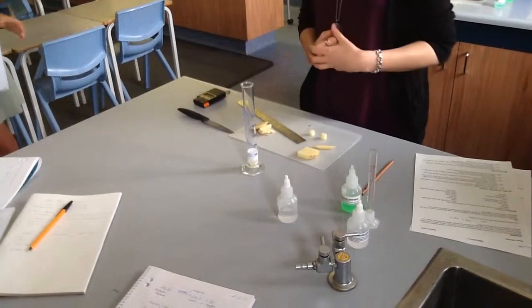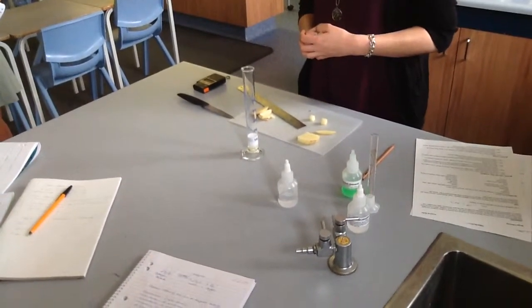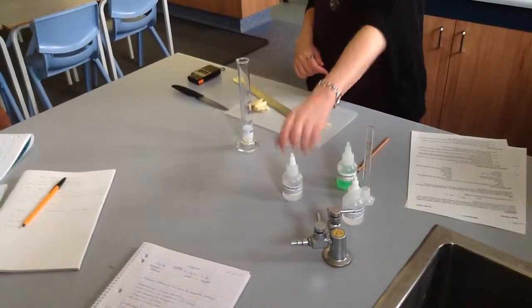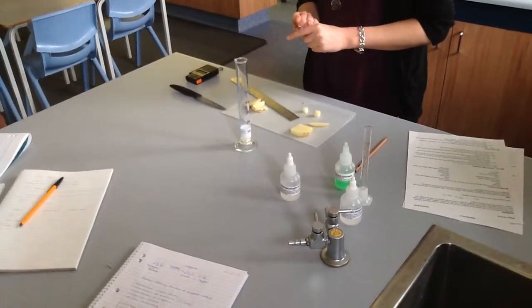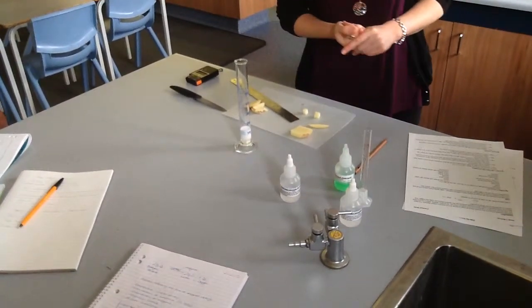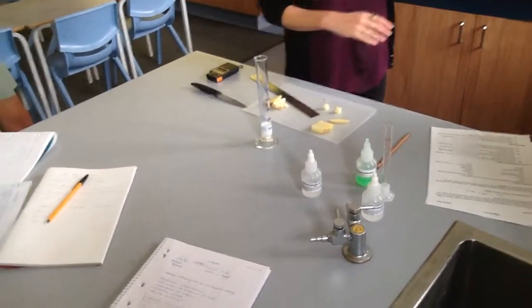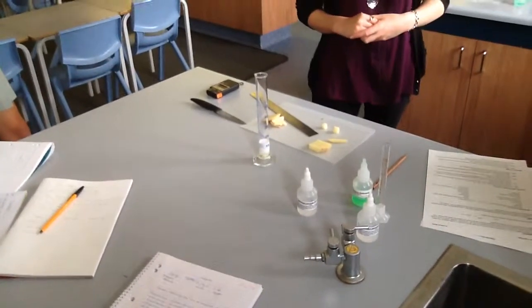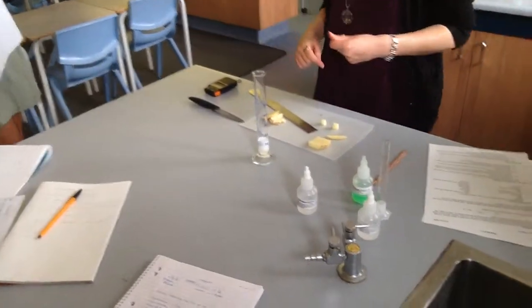What sort of factors could you easily alter with that to design your experiment around? You could easily alter the concentration of your hydrogen peroxide. What else could you easily do with that method? Could you do the source of the catalase? The source of the catalase, so you could do it several times with a different source. You could, but if you're doing that, what's your testing range going to be? How many different sources have we got? 3. So is that going to be enough data for us?